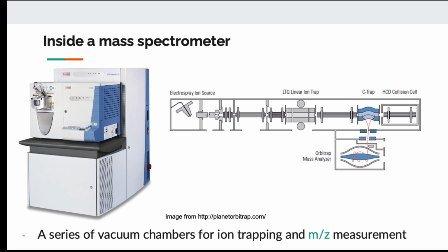So if you haven't seen a mass spectrometer before, it's about as tall as a human. And inside, this is a purely physical instrument. So the peptide, once it enters the mass spectrometer, is going to enter as a gas. So we start with, we know that proteins are solid, right? And then we dilute them in solvent, in aqueous. And then when we inject them into the mass spectrometer, they will be turned into gas.